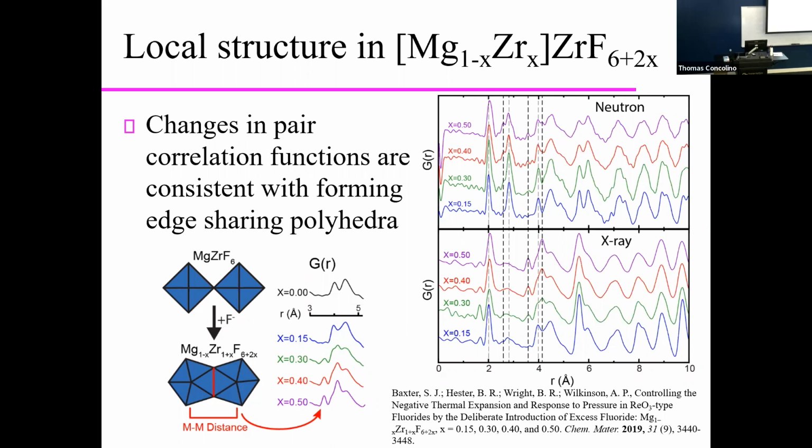We take away from that that this peak is probably associated with a pair of atoms with high atomic number. X-rays are more sensitive to high atomic number elements than low atomic number ones. Neutrons are somewhat agnostic. Okay, so this is probably telling us we have a pair of zirconiums, our heaviest element, separated by 3.6 angstroms. How do we interpret?